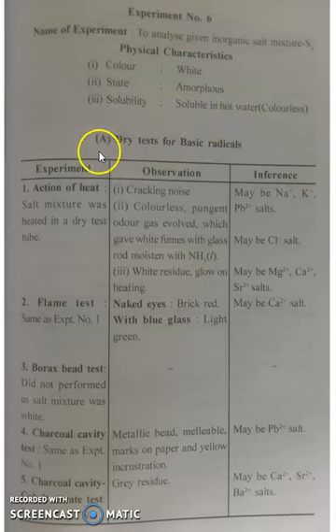Then you have to perform dry test for basic radicals. Basic radical means your cation part. So first experiment you have to perform, this is the experiment name.